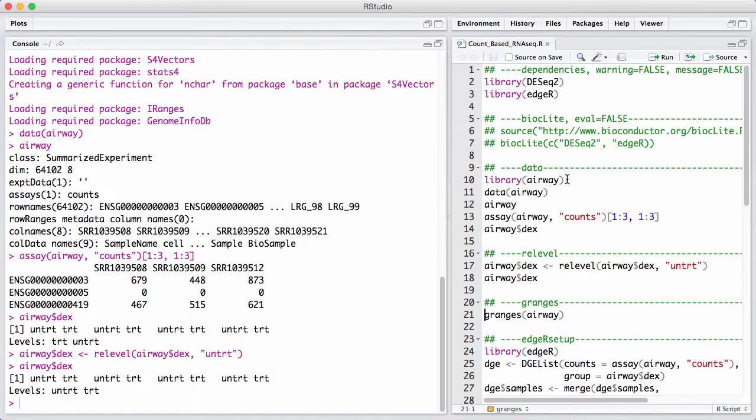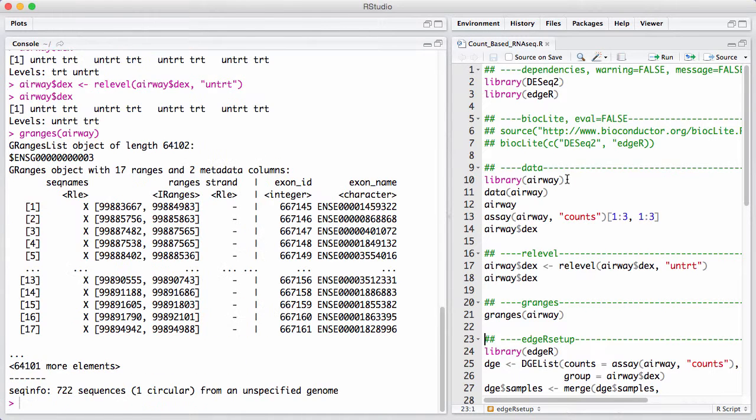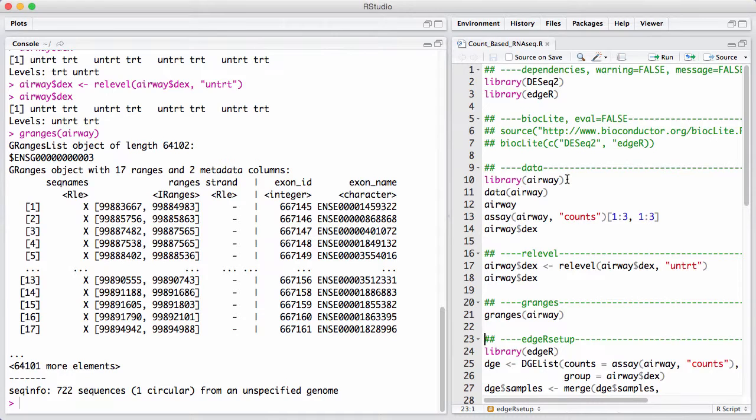This summarized experiment contains a rich piece of information on what the gene model is. We can see here for the first gene, we have the 17 exons that are part of that particular gene.